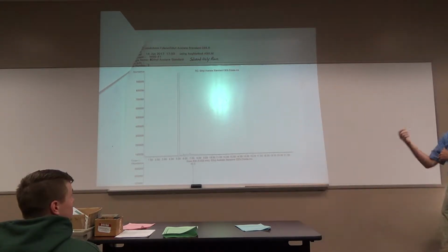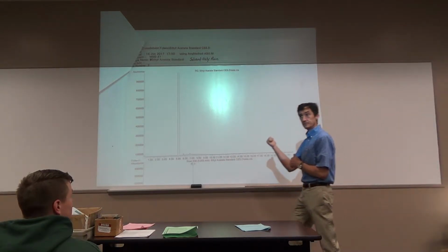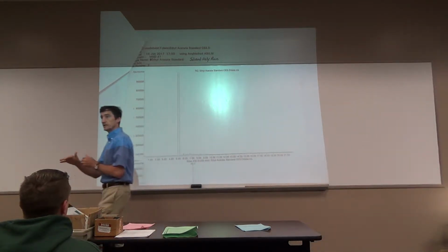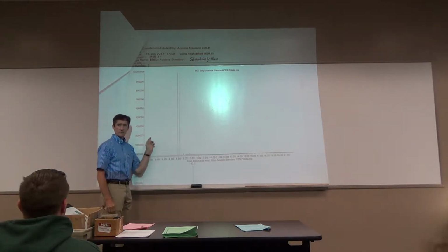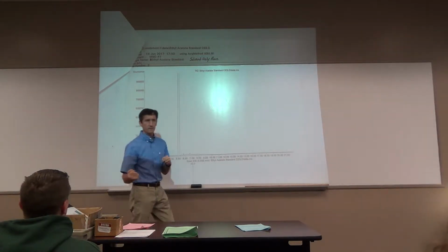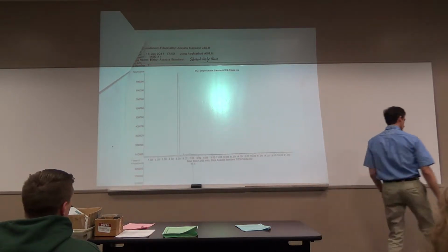So you know when you do an IR and it does a background? That subtracts out background for you. What's the background? It's running an IR of air: O2, nitrogen, CO2. But then the instrument cancels it out for you. Here you've got to cancel it out manually by looking at one spectrum and canceling it out from the other.